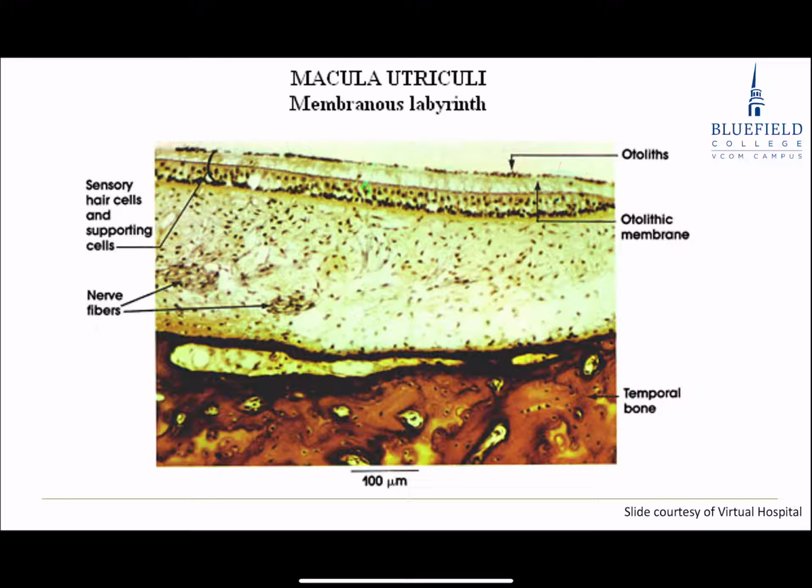Then you've got a layer here, which would be glycoprotein. It's very seldom you keep the otoliths on top. Here they did; normally you see one, maybe two little dark dots of otoliths. Here they kind of kept them throughout. There's nothing that really jumps out at you and says, that's the otolith organ. Learn it from the drawing, then go from the drawing to identify it here; that's the best way of doing it.